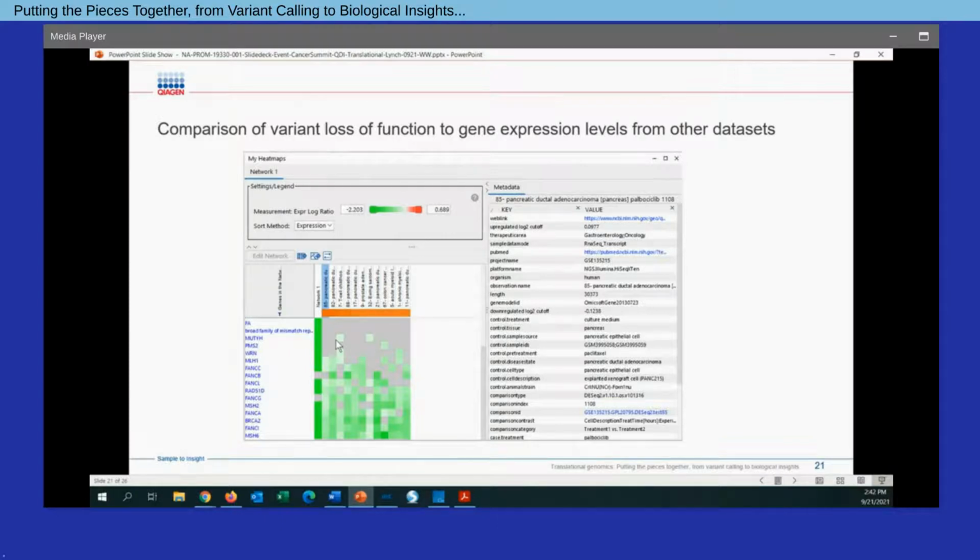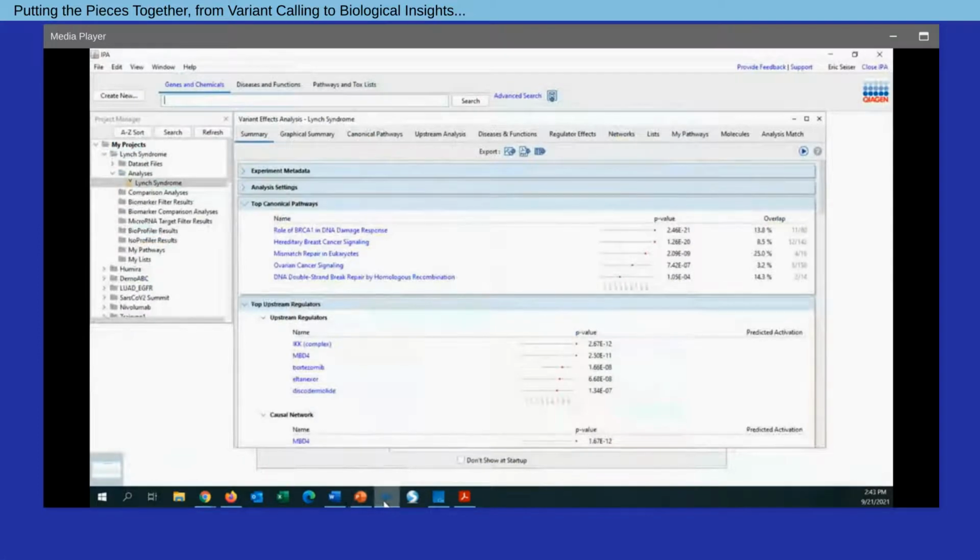So what I'd like to do now is take you through the process of interrogating this data, lastly within Ingenuity Pathway Analysis. To do so, I'm going to open up the software. And again, I've foregone going through the steps of uploading and analyzing the data. That's already been done in advance for time purposes. What I want to focus on are the results of the core analysis, and I have them open here for this particular data set. So we can see variant effects analysis within Lynch syndrome. This encompasses our loss of function genes.